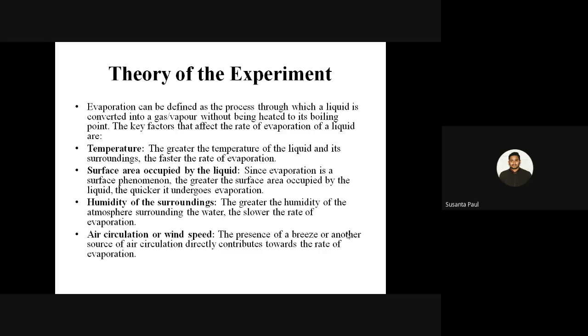In this experiment, we will see how the concentration of a product can affect the rate of evaporation. Okay. Now we are going to discuss the difference between evaporation and the other heat processes. What are the different heat processes? Other heat processes like boiling, distillation, drying. So these are the heat processes, and the difference between these three and evaporation.